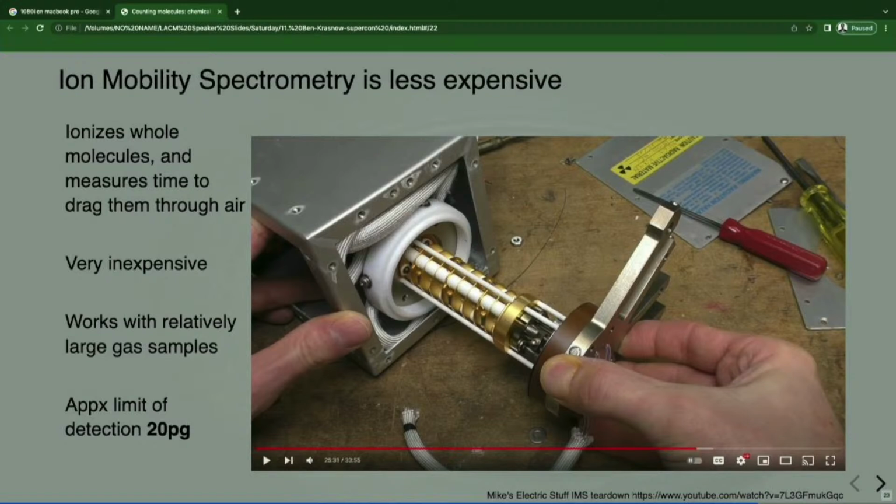When you go to the airport and they swab your stuff to see if you're carrying bombs onto the airplane, they'll put your swab into this machine and it will vaporize it and send it through an IMS. The reason it's an IMS and not a mass spectrometer is because it has to be cheap enough, small enough, and easy enough to use in an airport. They have to do the testing on site, so out of necessity, they had to use something smaller and cheaper than a mass spec.